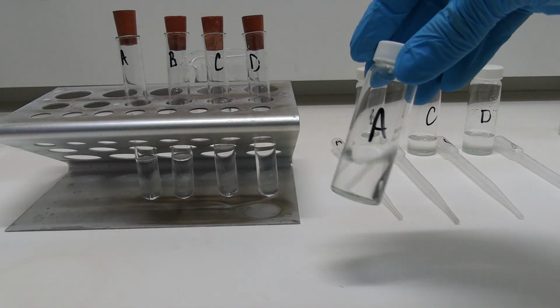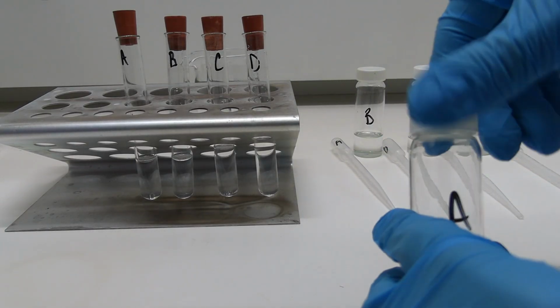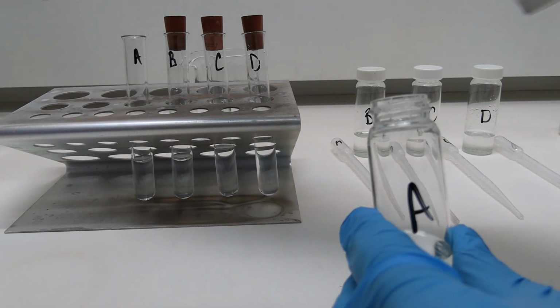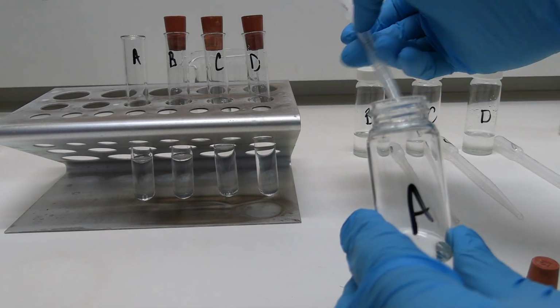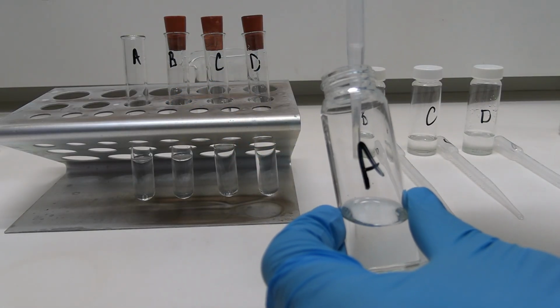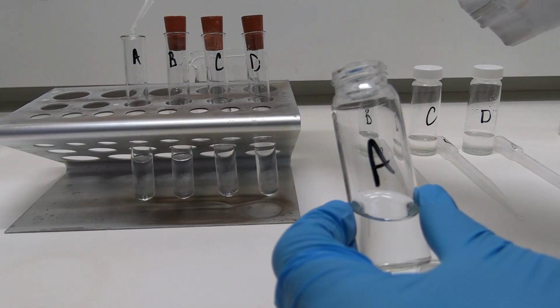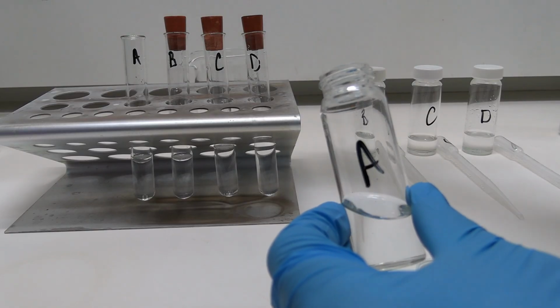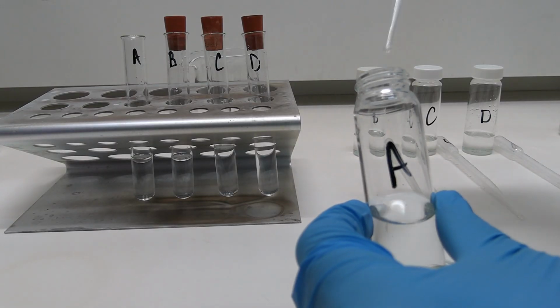We'll then add just a few drops of our samples to the corresponding test tubes, making sure to cover them again after each addition. I just want to point out, if you're carrying out this experiment outside of a fume cupboard, it's really important to minimize exposure of these unknown samples. They can be quite pungent and harmful to your health.